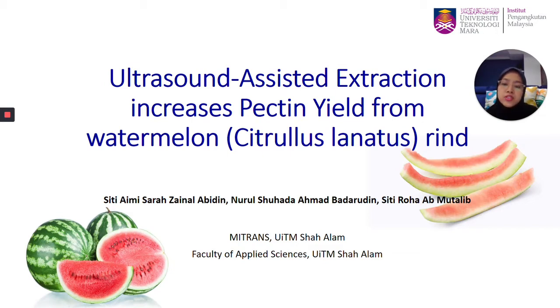Today I will present to you my project entitled Ultrasound-Assisted Extraction Increases Pectin Yield from Watermelon, Citrullus lanatus, Rind.